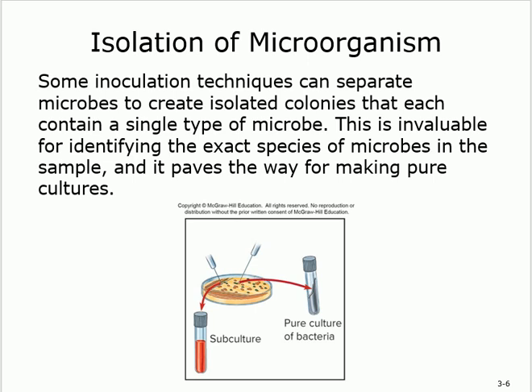So what should you do next? You are going to isolate the organism. Let's say I got a sample from urine, and you put it in that medium, you look at the changes, you can tell that it is changing, so you're done now. And then you're going to isolate the different organisms. However, with the newer techniques, from the beginning, at the inoculation, you can inoculate different organisms at different spots. So you can put one organism here. Now you don't need the isolation.